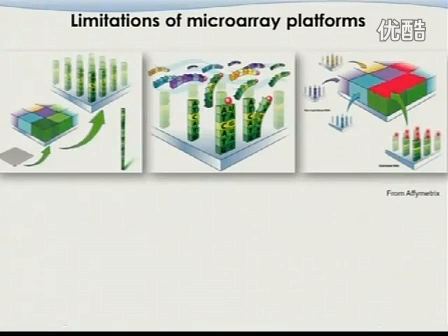I think I already showed these slides in the first lecture, if you remember, but I will go over this again. This slide is from Affymetrix, but I actually copied it from one of Jeanette's lectures. These are the basic principles of an Affymetrix array experiment. You can see this is the microarray, which looks pretty big here, but it's actually the size of your thumb. It's very, very small. And this surface is divided into many different small compartments, some of them over a couple million compartments. Each part is very, very tiny.